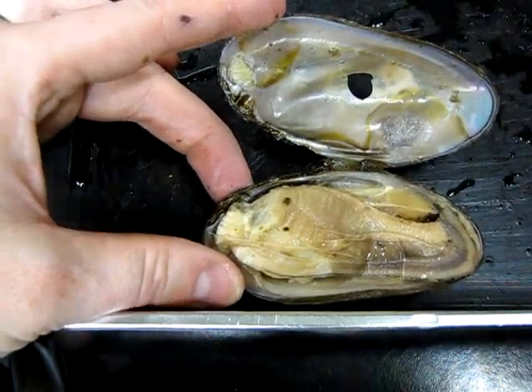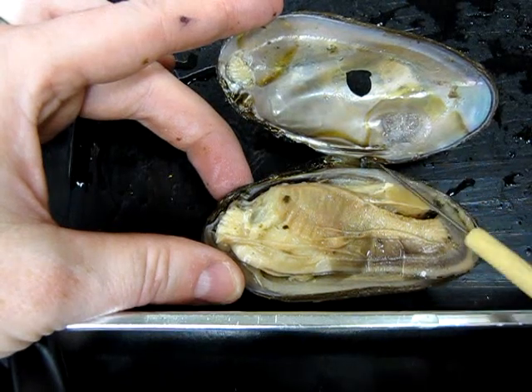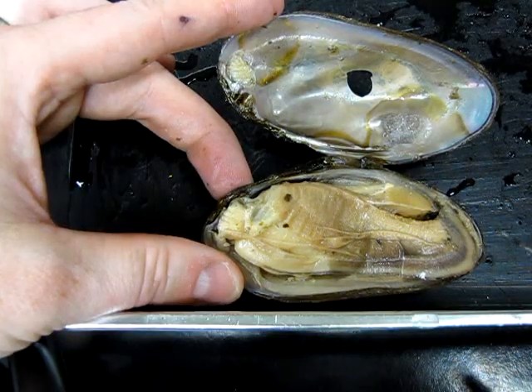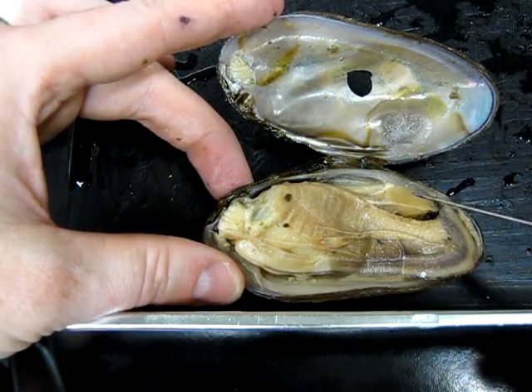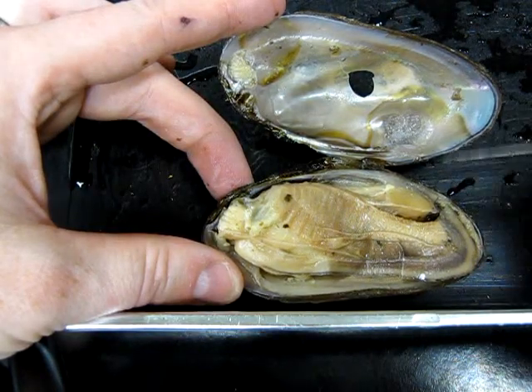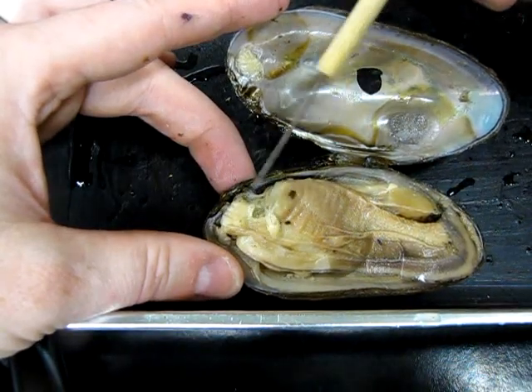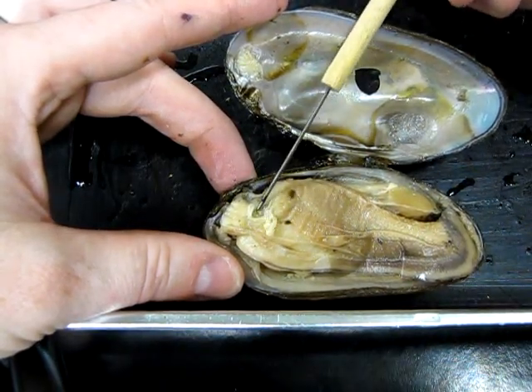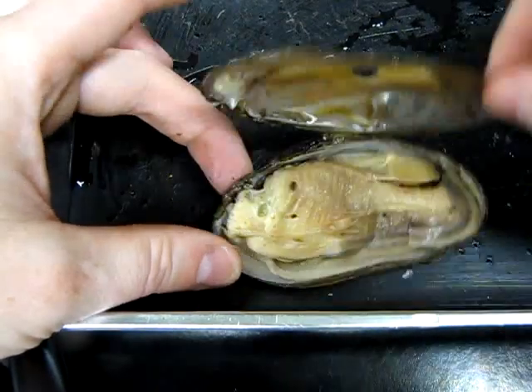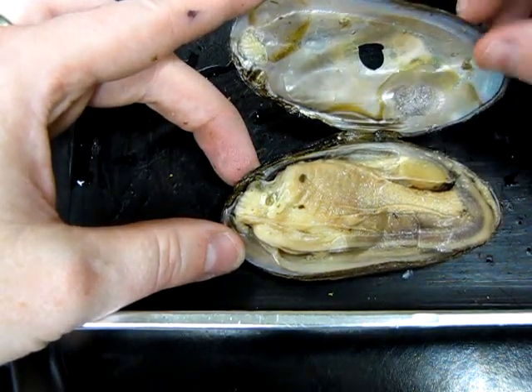I just successfully opened up the bivalve shell by making two incisions — one on the inside of the margin on either end of the animal — in order to dislodge the two large muscles mainly responsible for keeping the valves closed. Those are the adductor muscles. You can see one right here, very large, and there's another one on this side here, also quite large: the anterior and posterior adductor muscles. You can see now how the hinge ligament is allowing the valves to spring open.